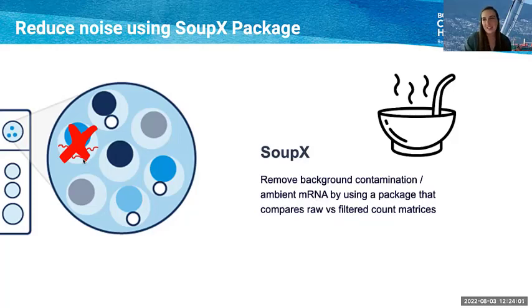And for very clean data sets, where the chip loading stage is very cleanly loaded, this package will really not remove anything that isn't necessary. Otherwise, if you have a single cell RNA sequencing data set like I've had before, where during COVID there were certain stop points, the cells were kind of sitting in limbo, the cells got more stressed, they start leaking mRNA, and there was a ton of ambient mRNA in the background that we actually had to go back through and filter through that cell ranger count missed. And that ended up really tidying up our data set. So that's what this function does. This is what this package does.